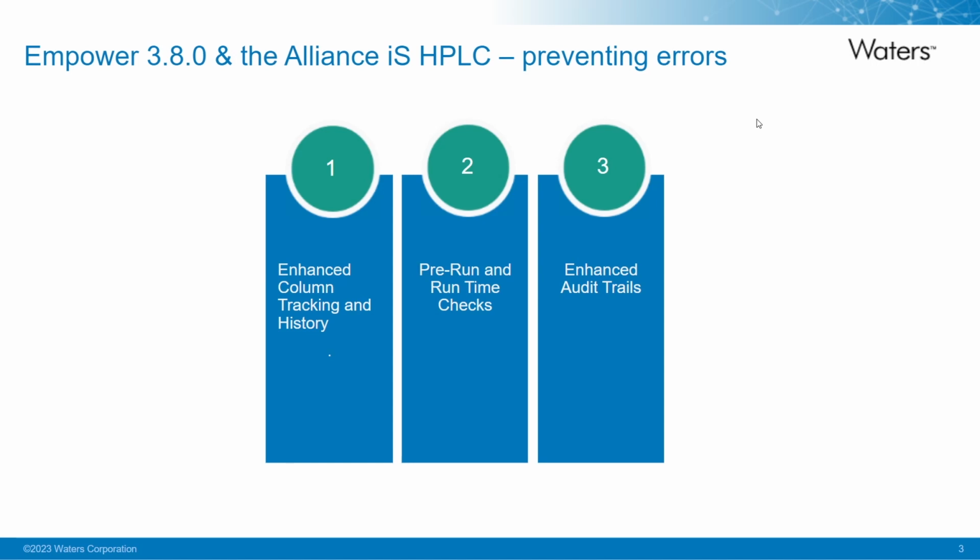We have the ability to set up pre-run and runtime checks so that if you go to start a sample set, it will check several things on the instrument before it proceeds, and then also enhancing the audit trails with more detailed information about the system itself. So that being said, let's begin.